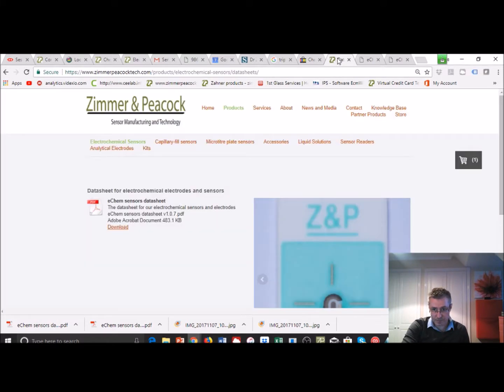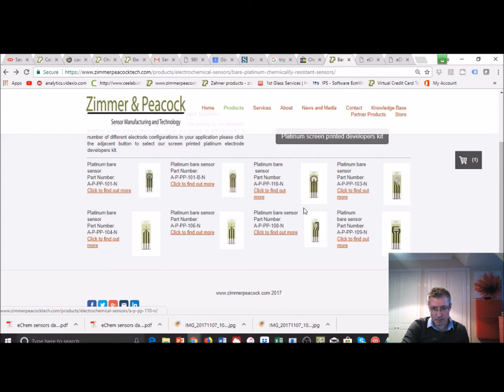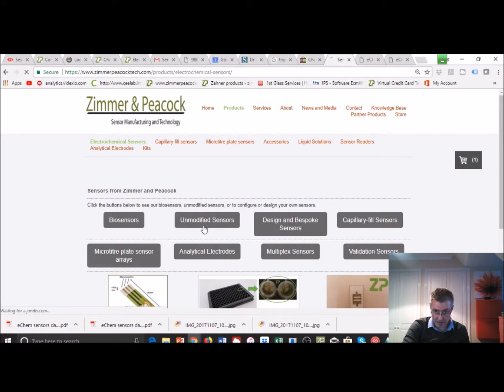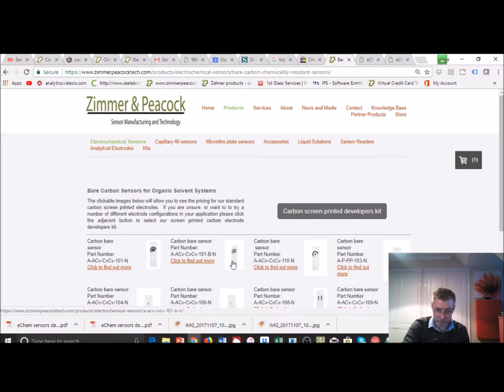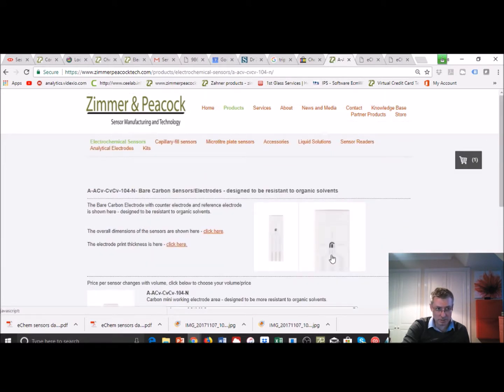Now, I'm going to go to the idea of measuring pH in an engine oil. One idea is to take a carbon electrode, and use it potentially in the first instance unmodified. So what I would do in that experiment is this. I would take an electrochemical sensor, the carbon electrode, and I would try doing just a CV of it in the engine oil, probably this guy here, and see if I saw features that were sensitive to pH, and see if those peaks moved with the pH.